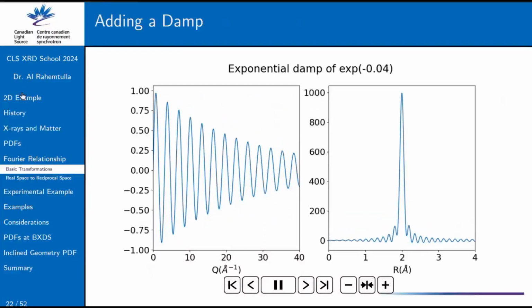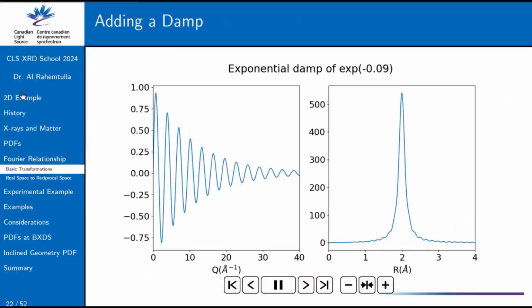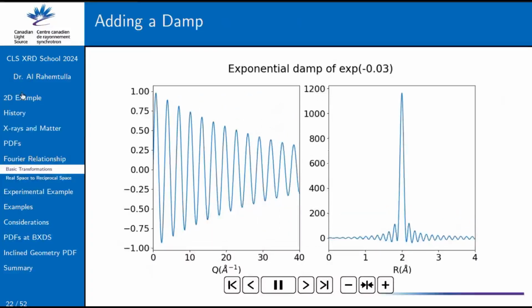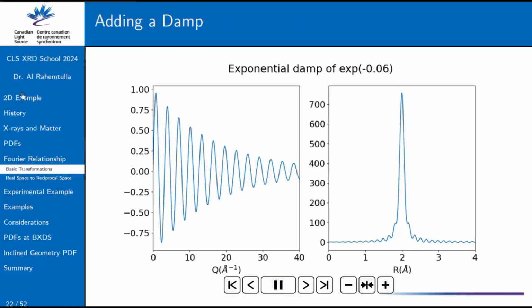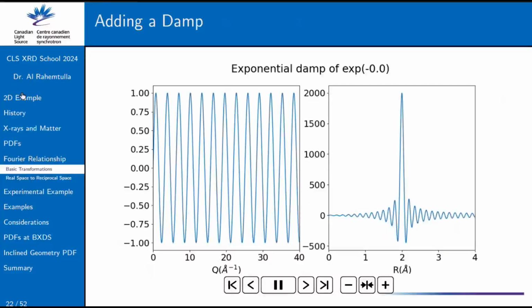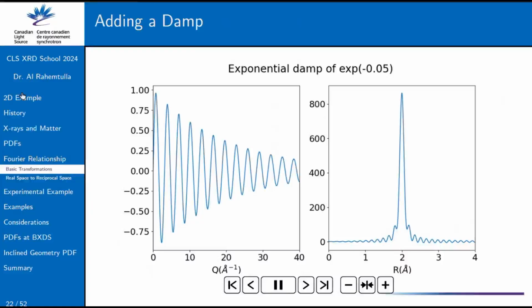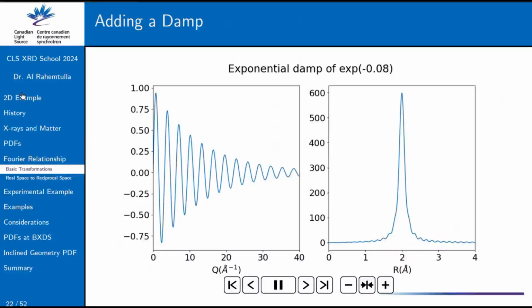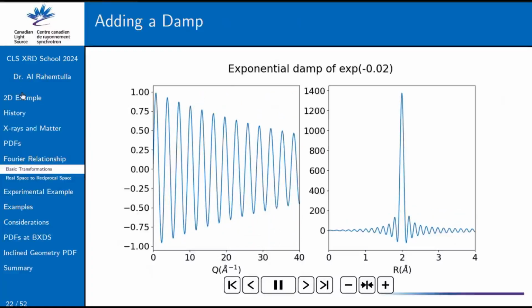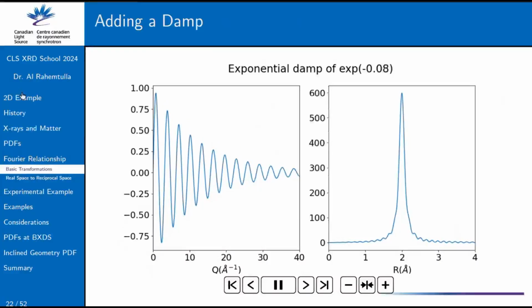It's possible. So there's a few things. One is going to be our instrument capabilities, especially depending on speed versus getting really good counts. The other thing is temperature. If your sample is warm or room temperature, or if your distributions are broad enough that they practically overlap, then no matter how well you measure, if they theoretically overlap perfectly and you can't deconvolute that in a theoretical model, you're probably not going to see it experimentally.